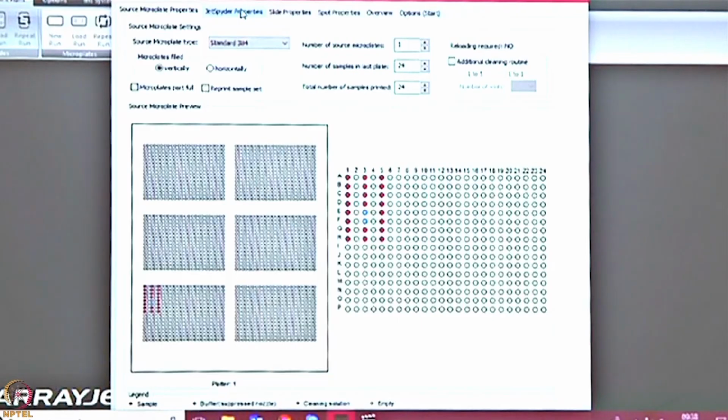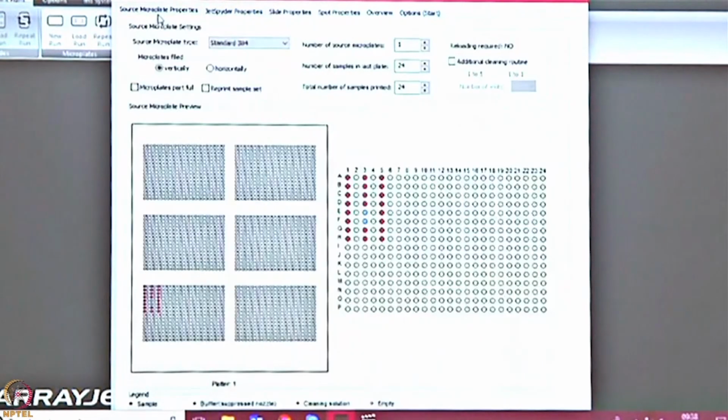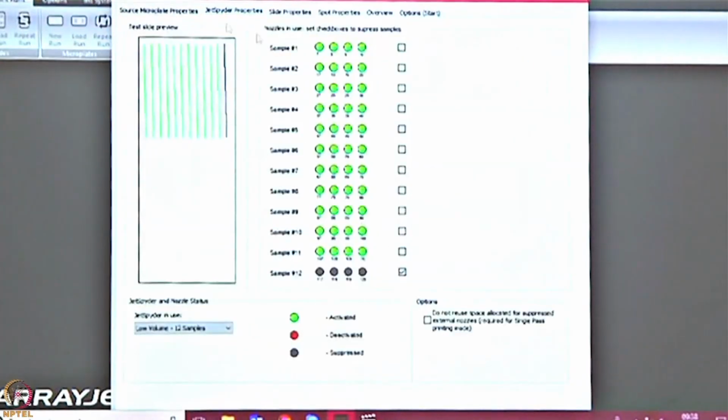So now I can print 22 samples because I was able to flexibly just go here, block 1, go back, 22 samples. If I wanted to just do 7, I had only 6 samples, I'll block all these. And now I've got only 6 samples that I'm working with.